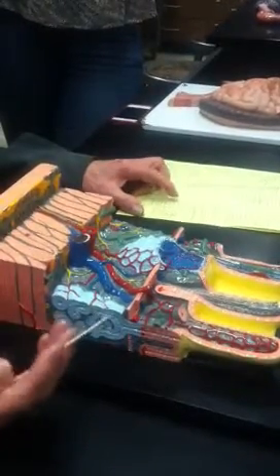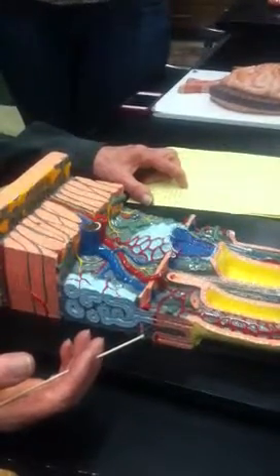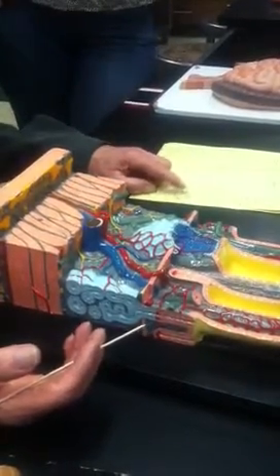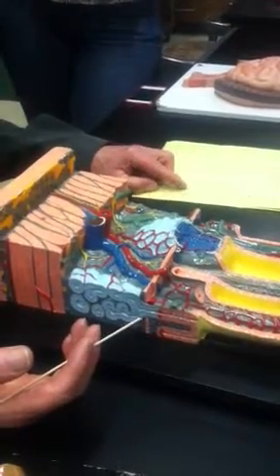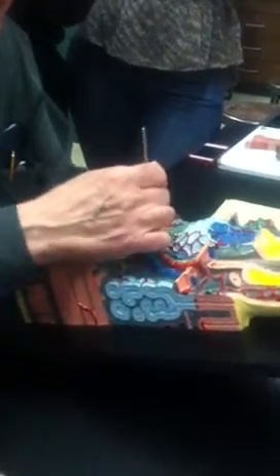Okay, then we have the plexus. There are two plexuses. There's Meissner's plexus, and there is Auerbach's plexus, which I mentioned down below. So first, Meissner's plexus. They control secretion, and those plexuses are located right here. You see these thick yellow portions? These are Meissner's. Auerbach's plexus are these over here that control the peristaltic waves of the muscle layer. Okay? So here's Meissner's controlling secretion. Get it? These yellow elements are Meissner's. Down here, these yellow elements are Auerbach's.